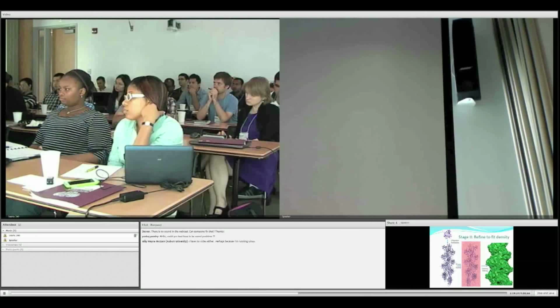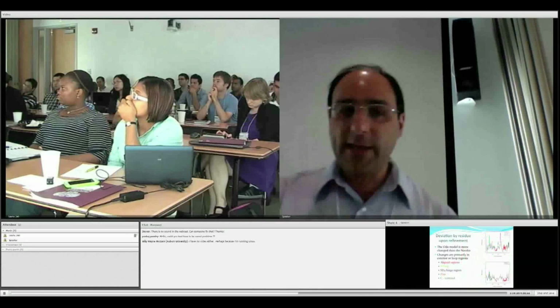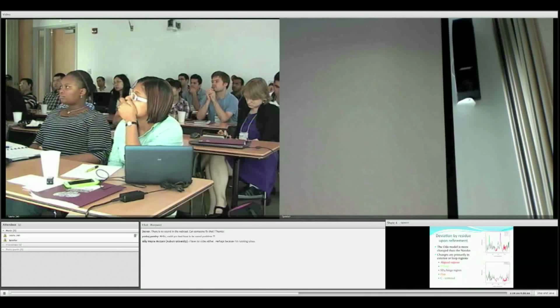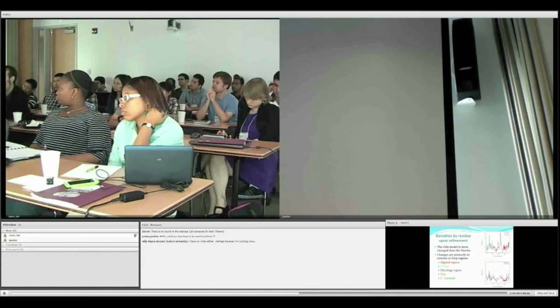This is the NAMBA model that we started with, and you can see we clean up the Rama. Based on this, starting from the monomer, we built an octamer, and then we added water. For the previous data, when we do flexible fitting, we do not use water.